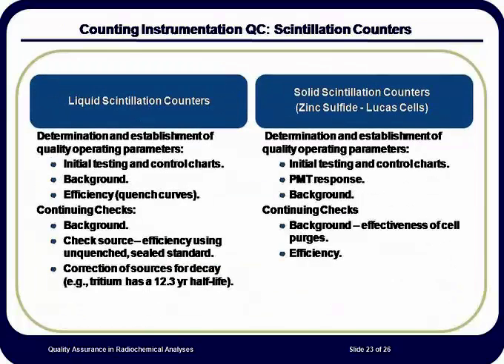The most commonly used source and analysis that the liquid scintillation counter is used for is tritium. Not only does the sealed source need to be decay corrected, but the standards and samples as well. One of the challenges is to establish a control chart so that the decay of the laboratory control check is taken into account, as are the central value, control, and warning limit lines.